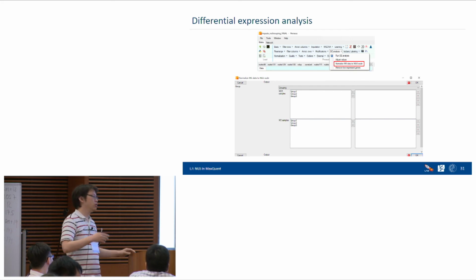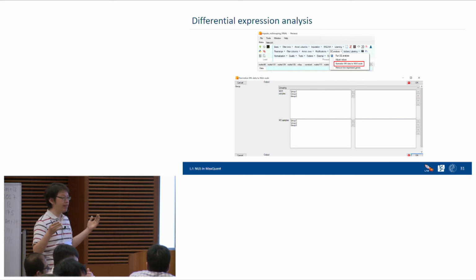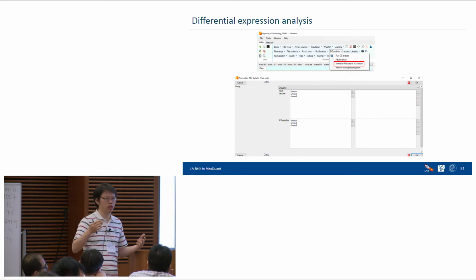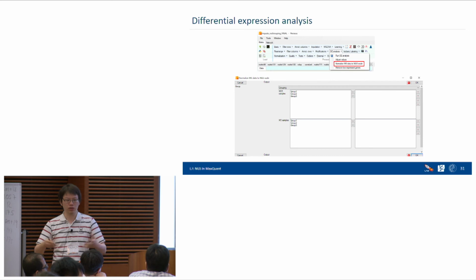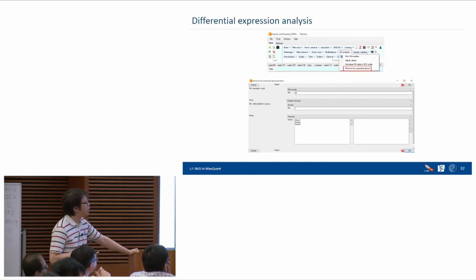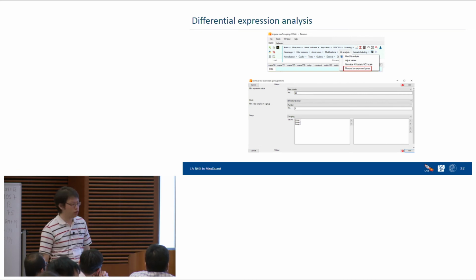If we don't do any normalization and just directly compare these two different omics data, you will find that all these proteins are up-regulated because they are really, really huge. So this plugin can help you to normalize the mass spectrometry range to the NGS range. Then you can easily compare. Of course, you can use the z-score, then everything will be standard.